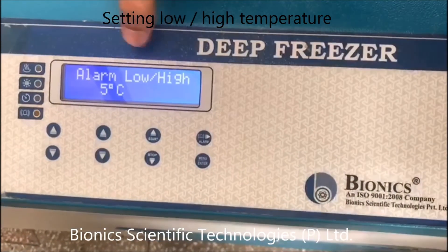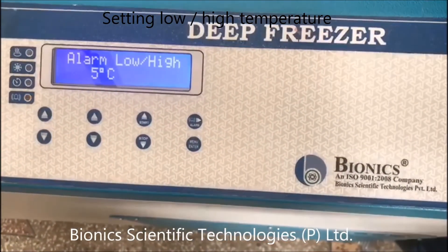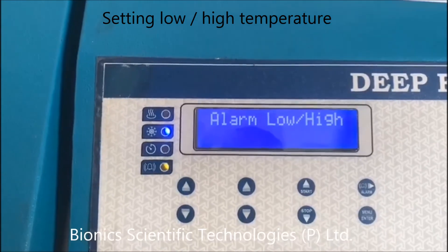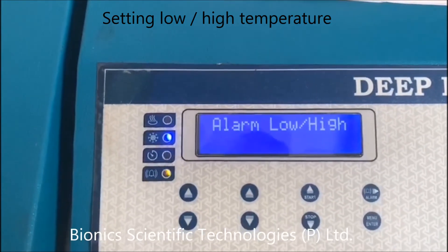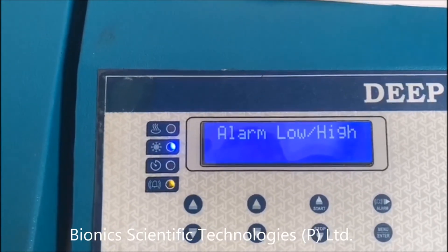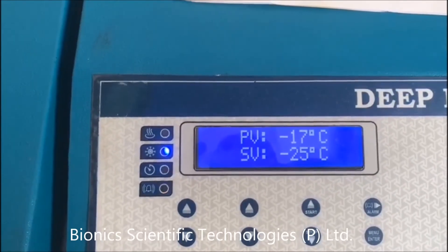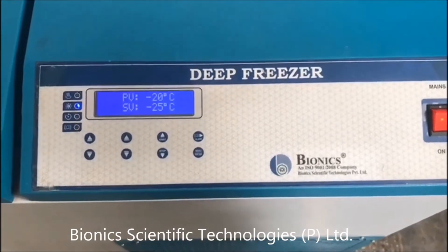It is showing alarm low and high. The alarm indicator activates if the temperature rises above 5 degrees Celsius or goes beneath the desired temperature which you have set. In both cases the alarm will be enabled.